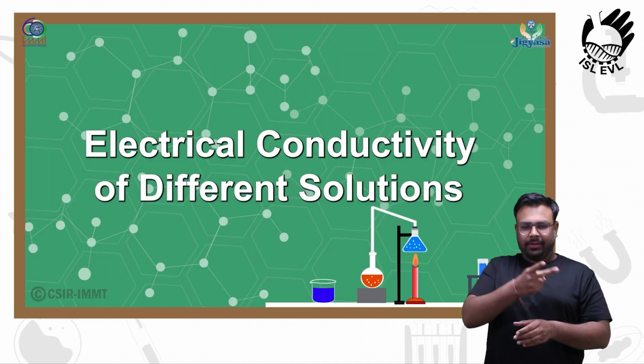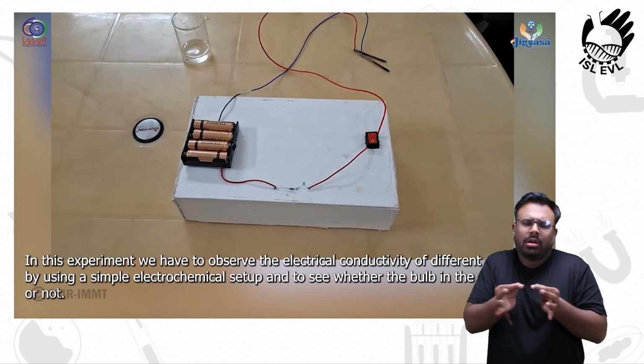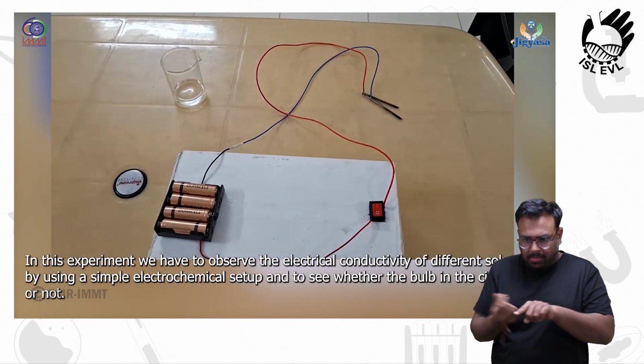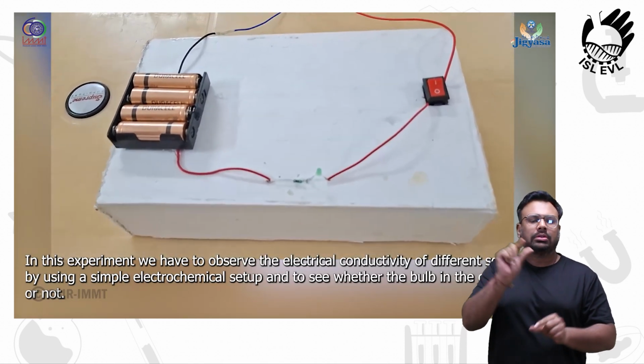Electrical conductivity of different solutions. In this experiment, we have to observe the electrical conductivity of different solutions by using a simple electrochemical setup and to see whether the bulb in the circuit glows or not.